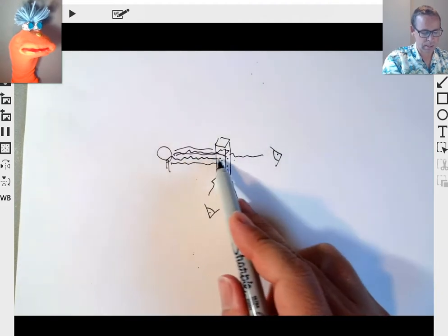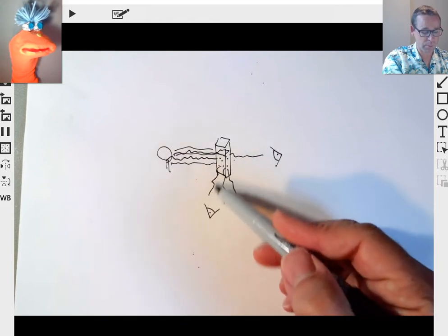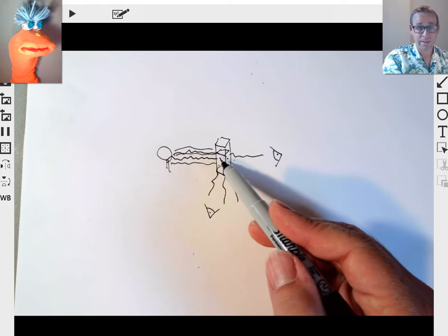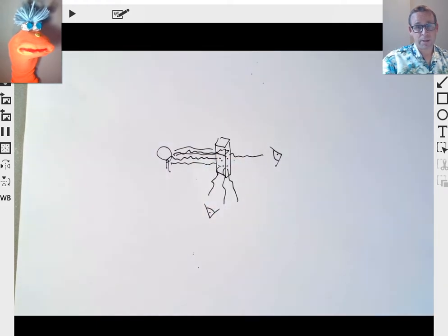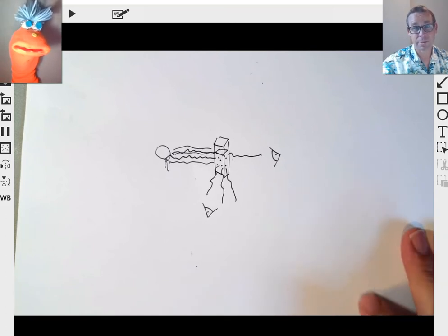Very good. So then we have a detector at a different angle, like at 90 degrees, and we're not looking at the light that's being absorbed. We're looking at the photons that are being emitted or fluoresced after the electromagnetic energy is absorbed. Okay? And in this type of experiment, we're going to be looking at proteins because proteins frequently fluoresce.